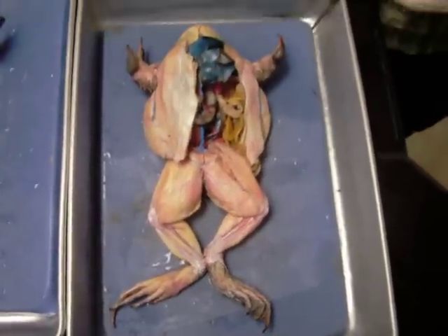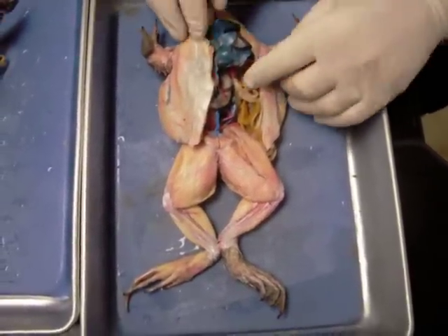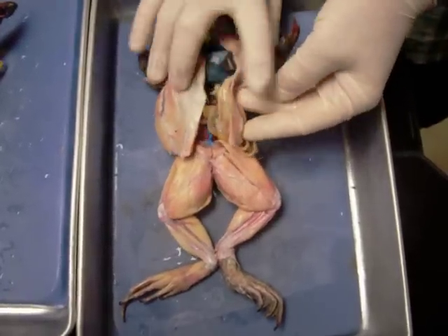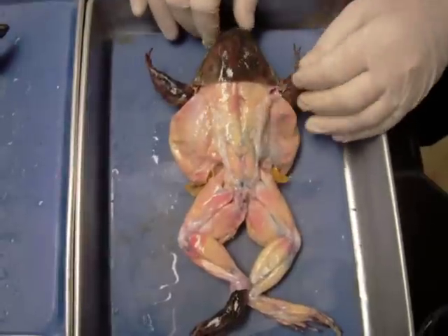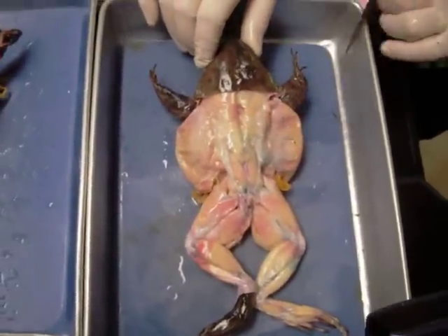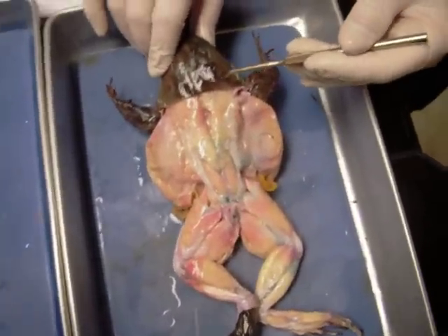This is a dissection for Bio 185 Zoology here at Golden West College. This is a frog — specifically a male frog — and we'll go over the external anatomy first. The specific genus and species is Rana catesbeiana, commonly known as the bullfrog, and it's a male.